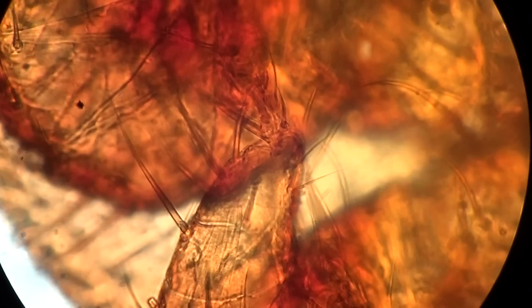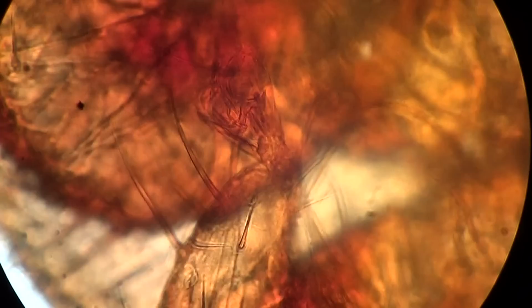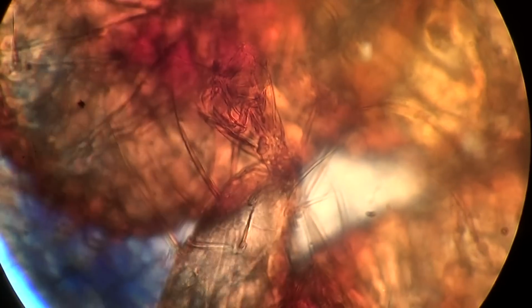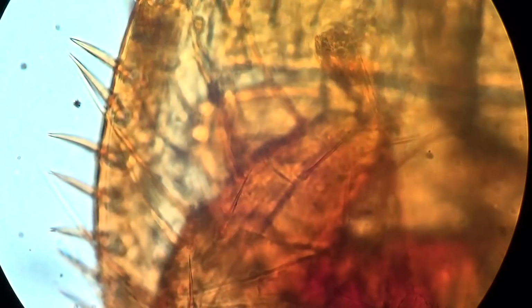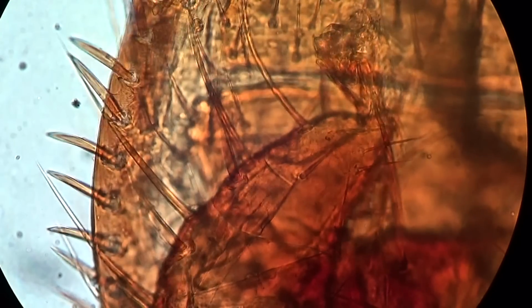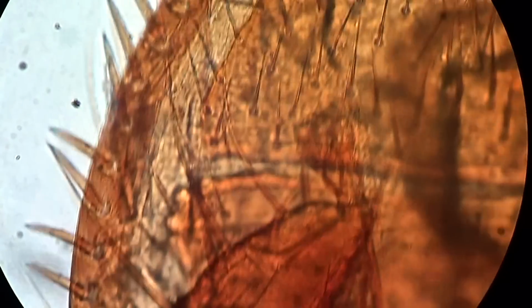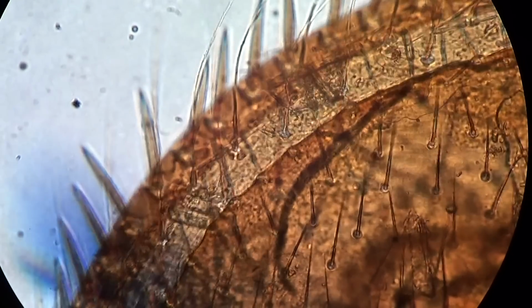Each leg has such a pulvilla, a triangle-shaped pulvilla, and very long seta and sensilla on the surface of the whole body. On this body plate you can see very long seta on the surface of the body of this Varroa mite.